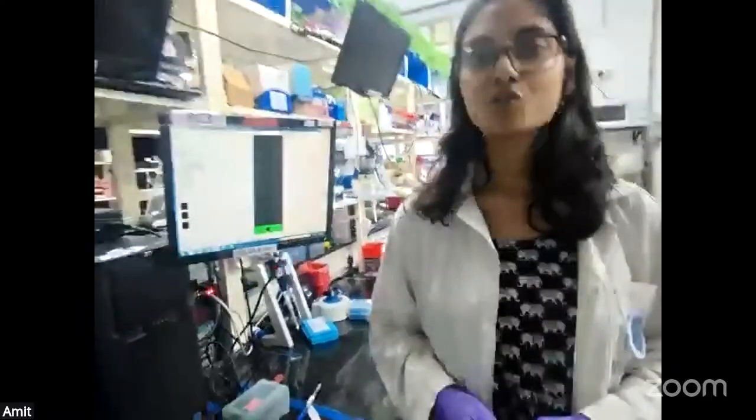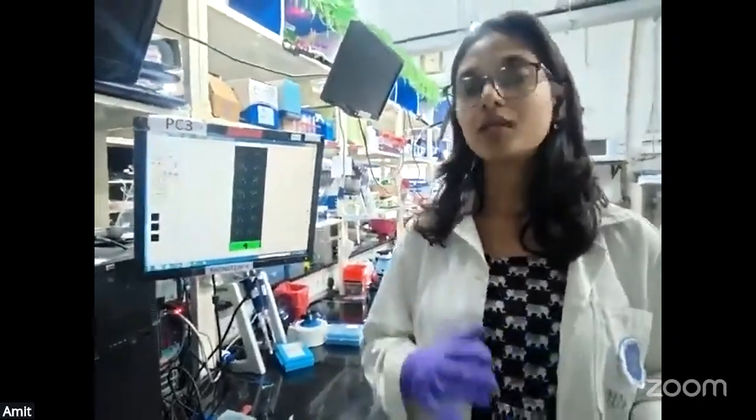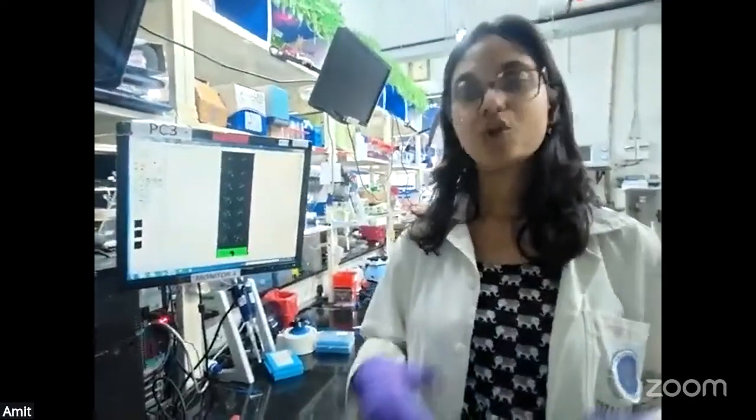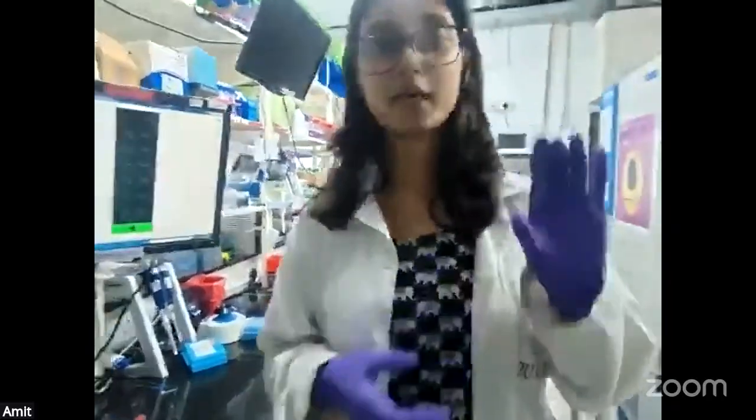My name is Vishali. I'm going to explain what microarray is. Microarray, by definition, is a high throughput technology where we can analyze a vast range of biomolecules like protein, DNA, peptides, or metabolites like drugs, etc., on a very small scale. So this is a chip which is called a microarray chip.